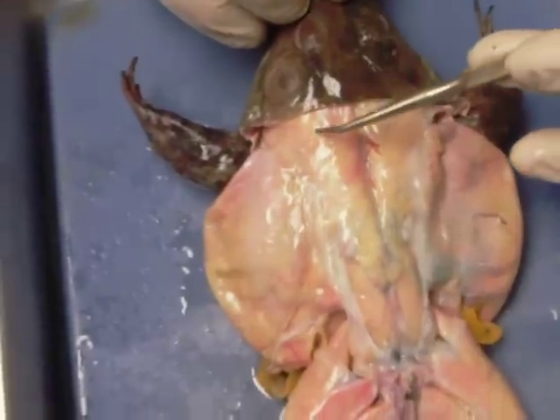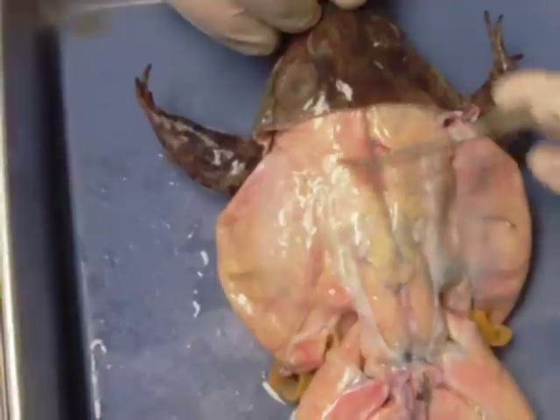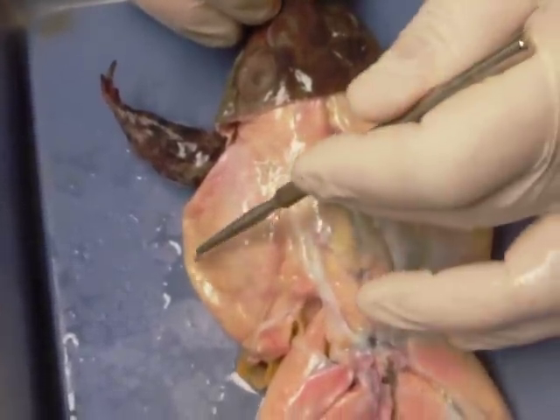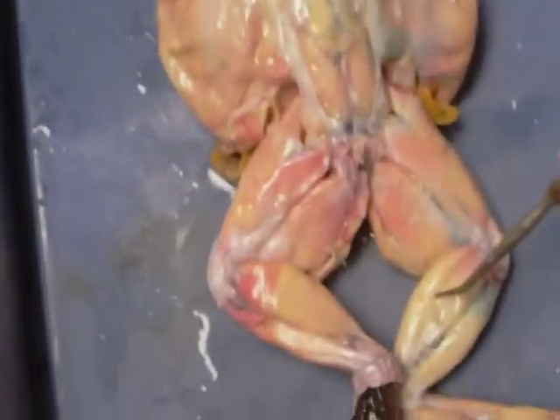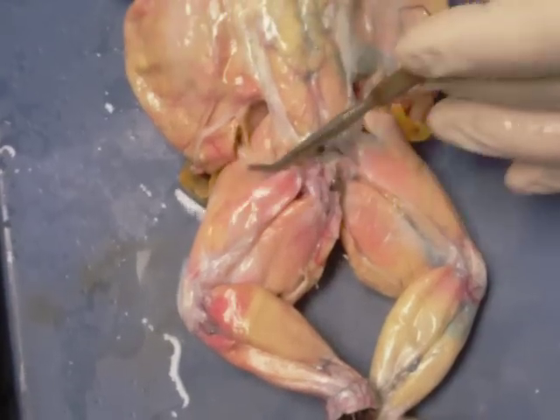Now we've got him flipped over on his back. Let's take a look at a couple of muscles. Not well defined on this particular specimen is the latissimus dorsi — it should be found right in here, you can kind of see a feel of it right there. Here we have the external obliques on the side, and then here we have the gastrocnemius, and here is the triceps femoris.